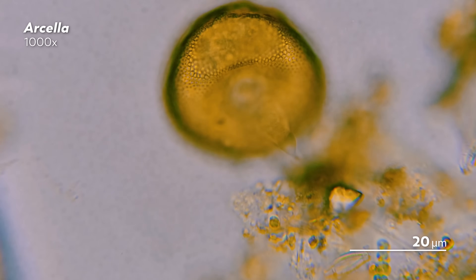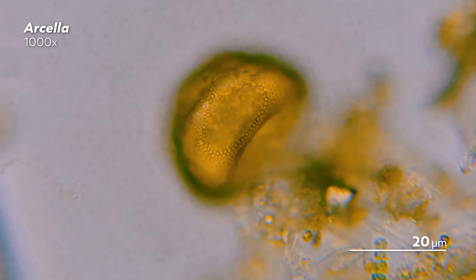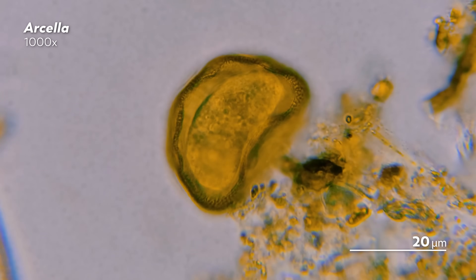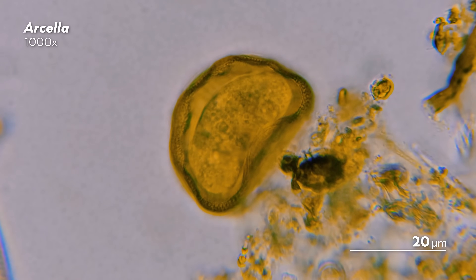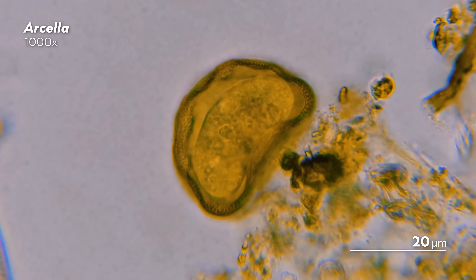All of the footage we're showing for the rest of this video is footage that James, our master of microscopes, has recorded using our Microcosmos microscope. And if you don't have our microscope, that's okay — most of the tips we're talking about today should help you out as you start on your microscopy journey, no matter what microscope you choose to start with.